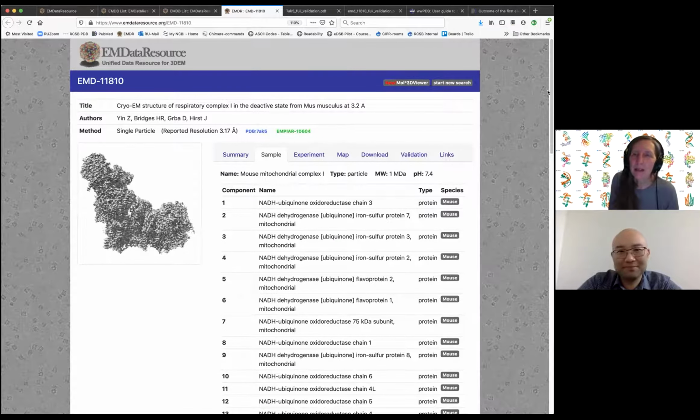But I guess there are ways that you can make it easier on yourself. So for MMCIF format, there's a tool called PDB extract that you can use that will move your structure from PDB format to MMCIF format. And you can also enter all the sequence information there, and it will produce an MMCIF file that you can deposit.